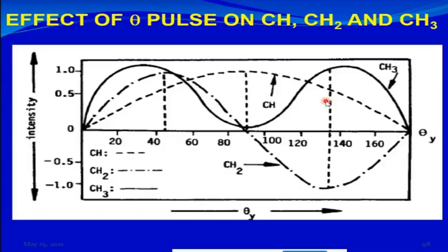You see, when this magnetization vector is in front of the detector, if you remember, I told you that you see a larger signal. So the intensity is higher in the positive phase, right? As soon as it goes away, like for example, if it is here in front of the detector, when it is moving away from the detector, the signal dies out, and when it is exactly opposite to the detector, it's almost zero, and then it starts growing up when it comes back closer to the detector. It comes here and then it goes back, right?